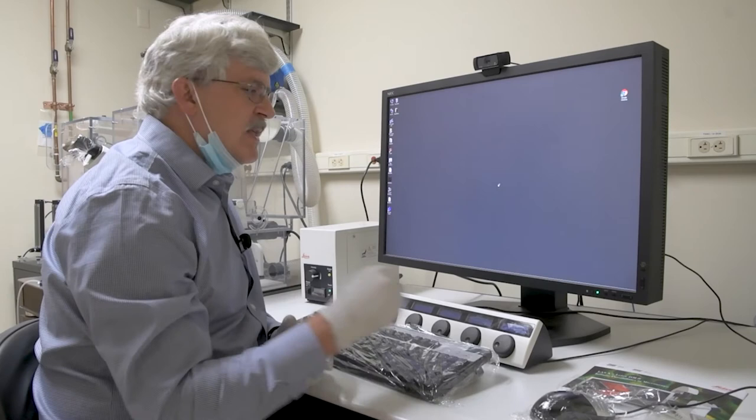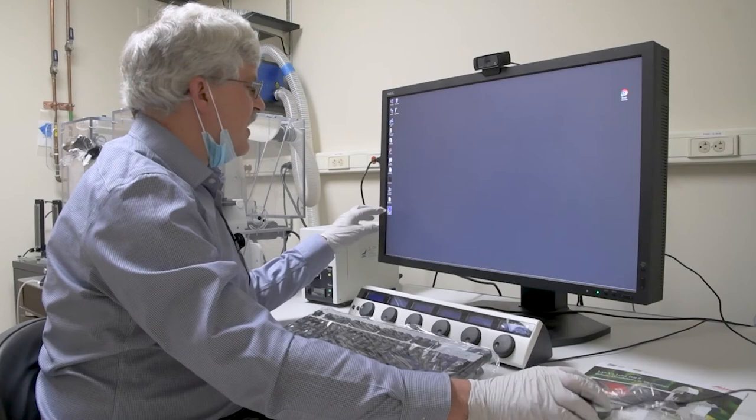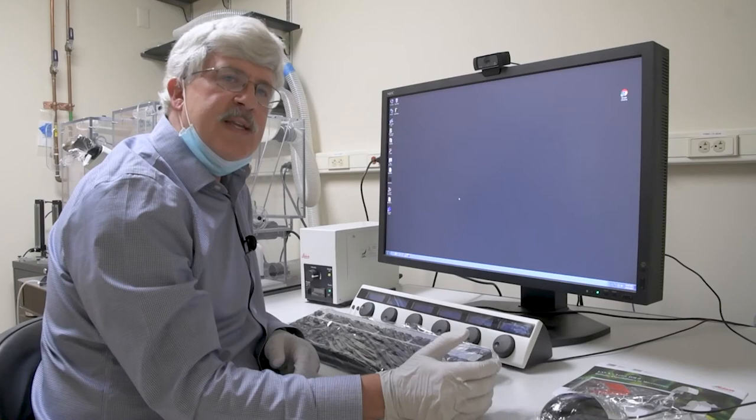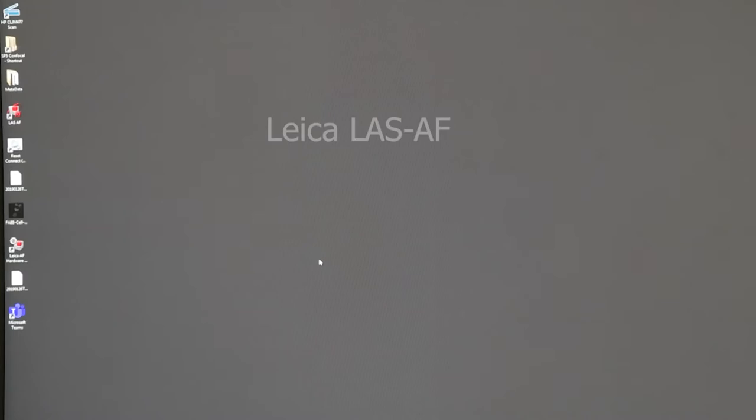If it automatically starts up you'll see Teams next. If not you can always click on it on the side here or it's pinned to the bottom. If you need to communicate with any of us while you're working in here, this is going to be the way to do it. Now it's time to start up the Leica LAS AF software. Over on the left the icon is the one in the middle with the red and the white. Double click.